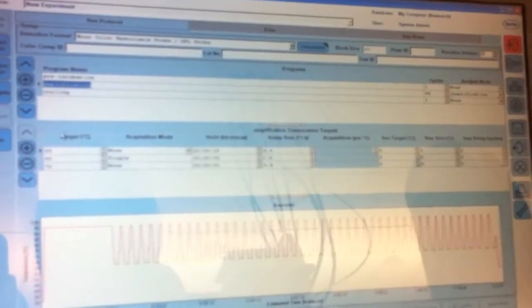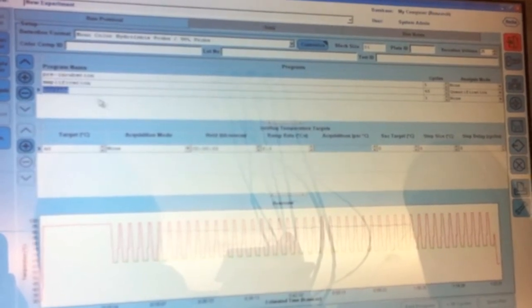Double-check your program that your pre-incubation steps, your amplification steps, and your cooling steps are what you want.